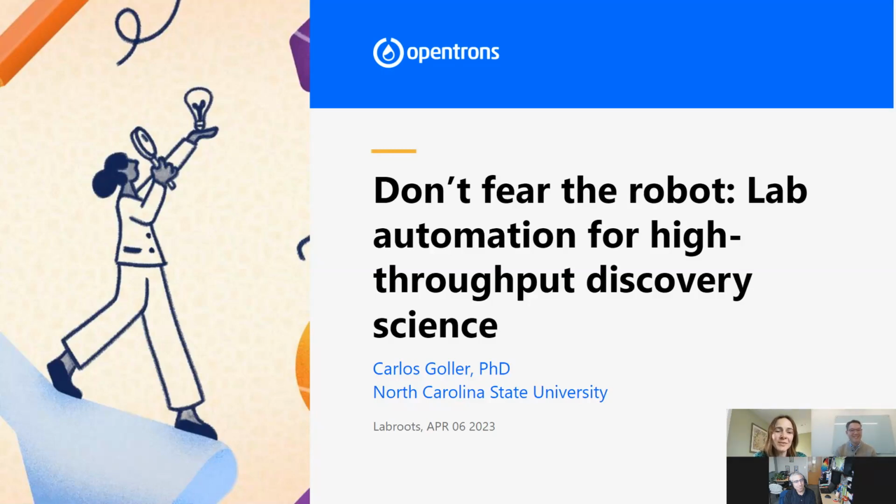Carlos, any final words? I think it goes back to that: don't fear the robot. If we can get people realizing that the instrument may not do what you want at first, but you can go back and forth with it and learn really cool tricks. And then once you have a script that runs something, it's really fun.